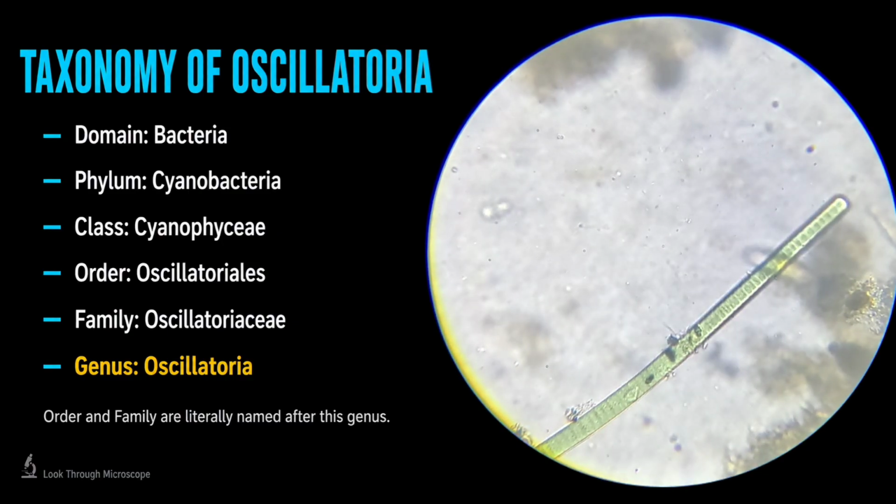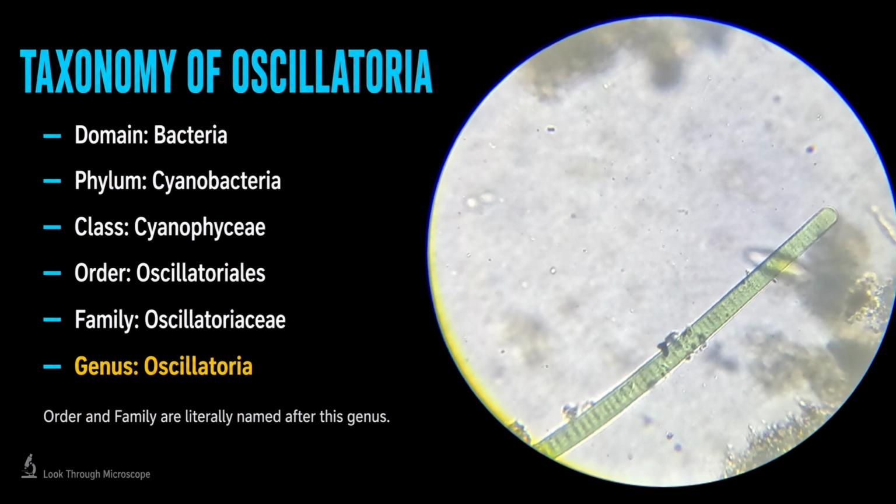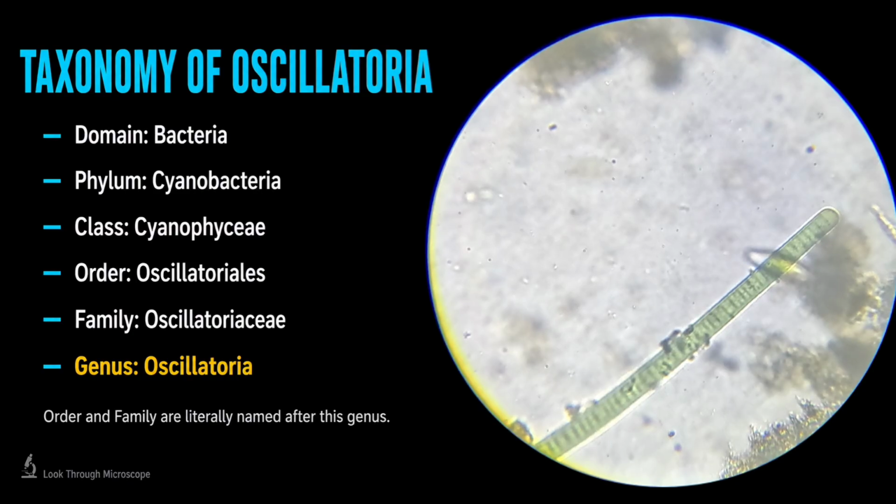It comes under the class Cyanophyceae, order Oscillatoriales, family Oscillatoriaceae, and the genus we are covering is Oscillatoria.